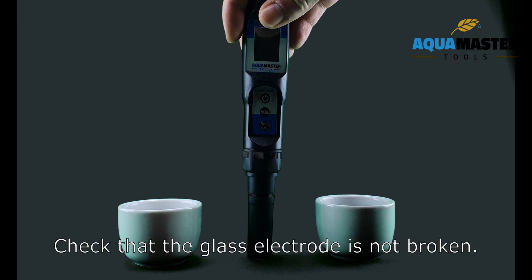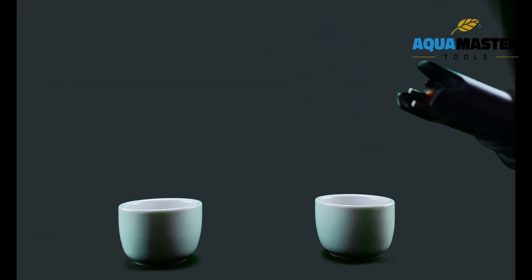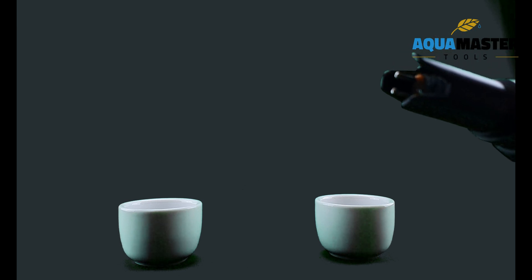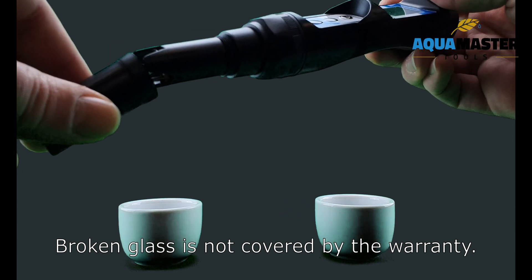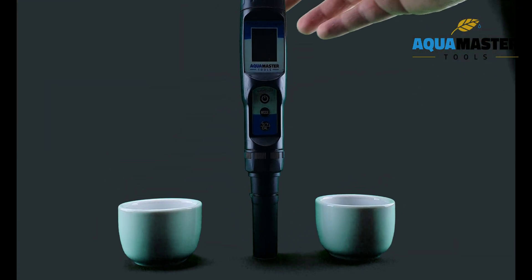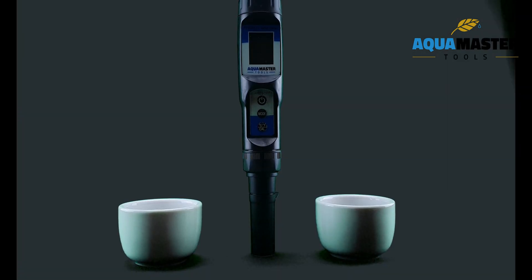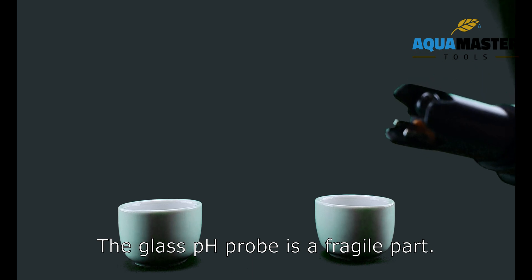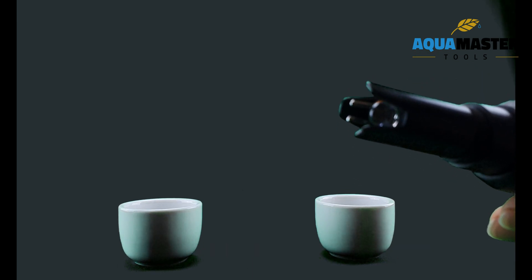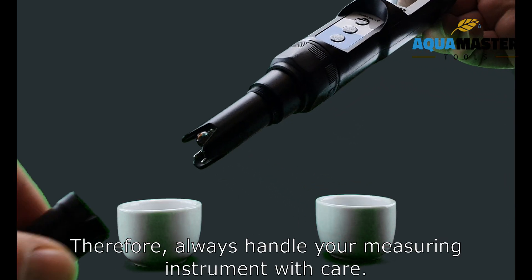Check that the glass electrode is not broken. Broken glass is not covered by the warranty. The glass PH probe is a fragile part, therefore always handle your measuring instrument with care.